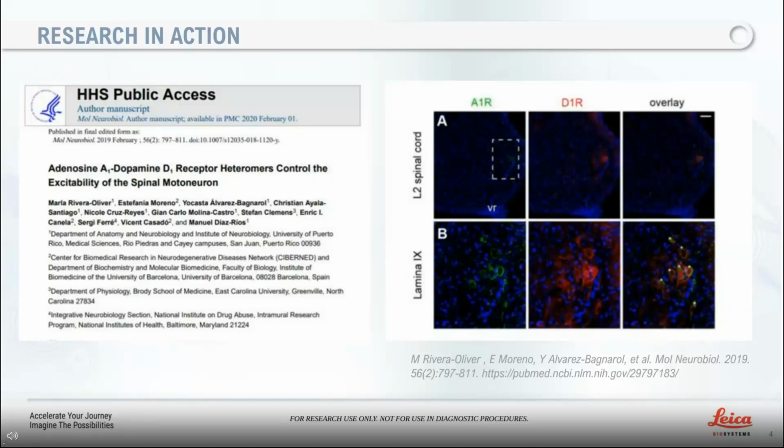During my learning process, I did a lot of troubleshooting with cryosectioning, like working with uneven tissue and coiling sections. The hacks we will discuss today have the potential for universal applications within any field that uses cryosection, as they are foundations of good practices. I hope you find inspiration and my talk provides value to your research project. So let's jump right in.